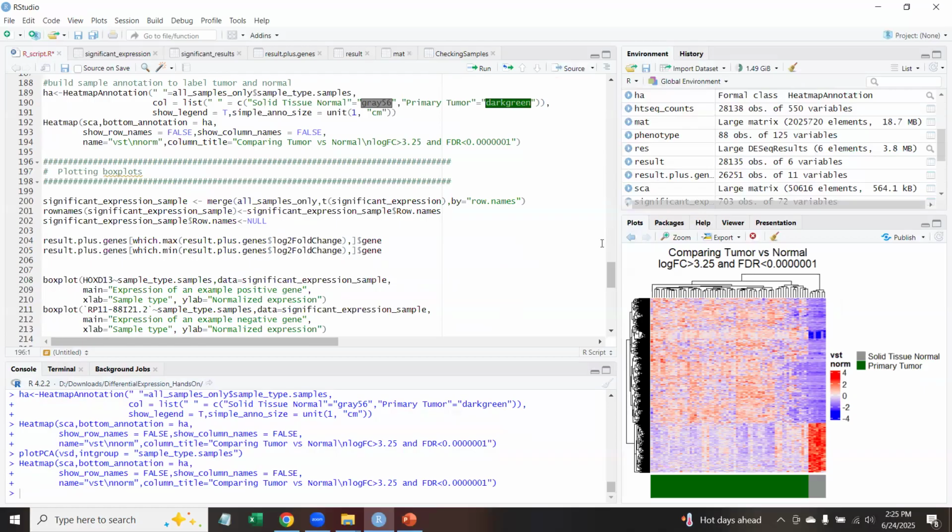Now, is this because the tumors are less aggressive, or because they have a higher proportion of normal sample that might be attached to them? We don't know. Or these could be the tumor samples that have paired normals in the data set. We're not accounting for that in our analysis.